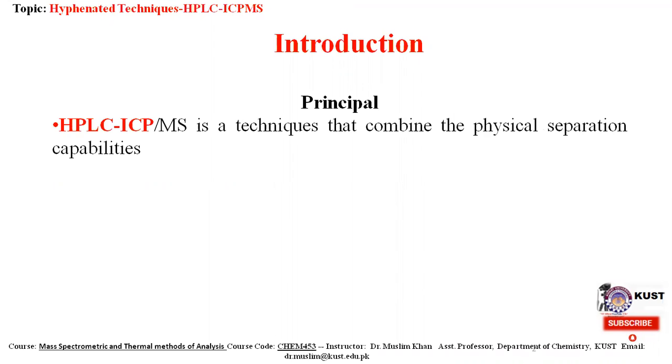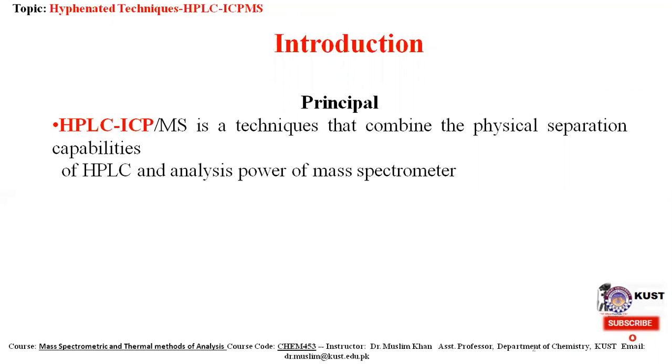The HPLC-ICPMS is a technique that combines the physical separation capabilities of HPLC and the analysis power of a mass spectrometer.